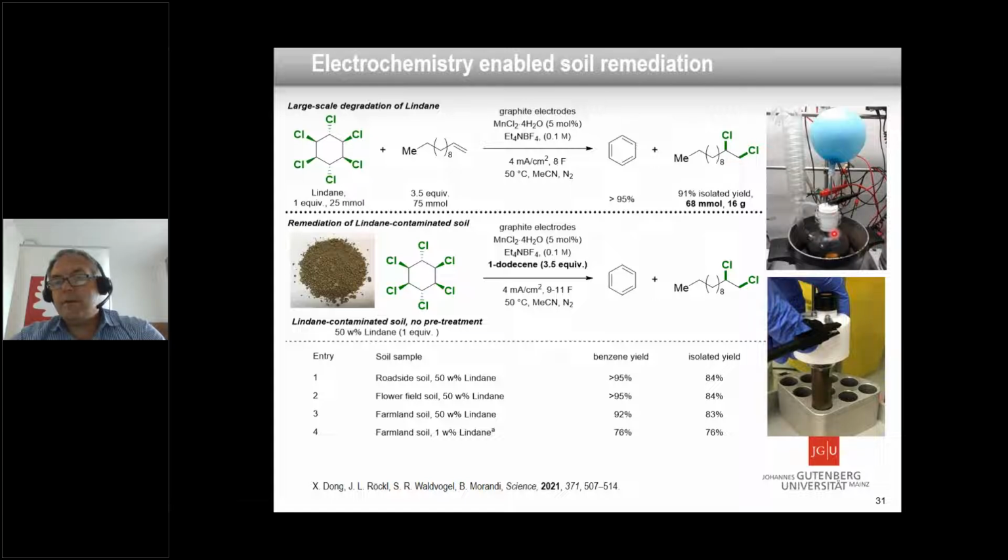Here you see the same plugs. Now we have a different container, since we have to heat that, but you can use that in a very simple way to combine electricity with your other organic reactions. And that's what I want to tell you. And I'm open to questions.